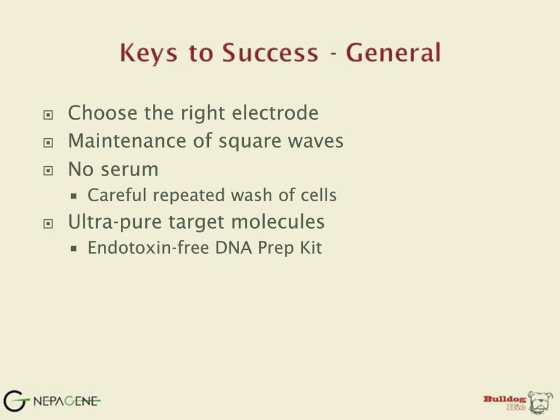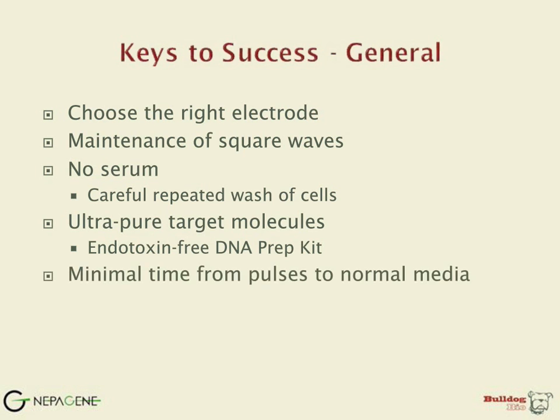Try to minimize these. Everyone wants to minimize the amount of time an experiment takes by multitasking and batch prepping. Do not do this for electrokinetic transfer procedures. The amount of time that cells spend away from a standard media environment directly impacts their survivability. So after each sample is pulsed, immediately replace the media with serum-containing media. For electrokinetic transfer, shortcuts are typically bad. Did I mention shortcuts are bad for electrokinetic transfer experiments?